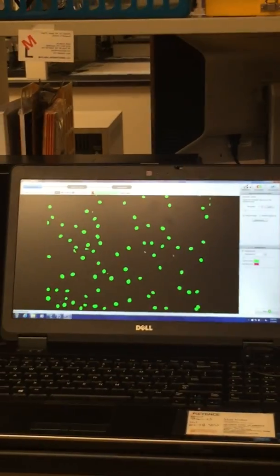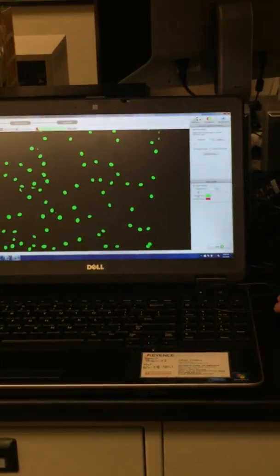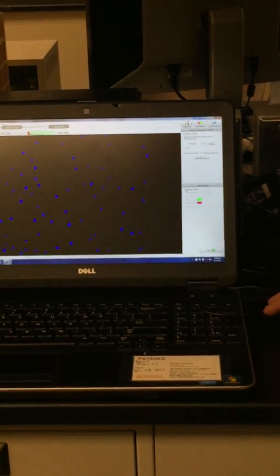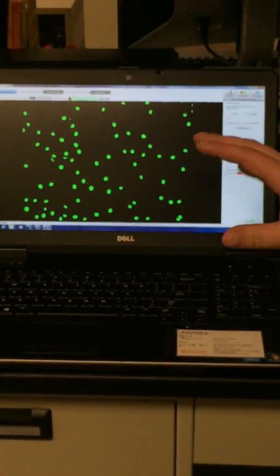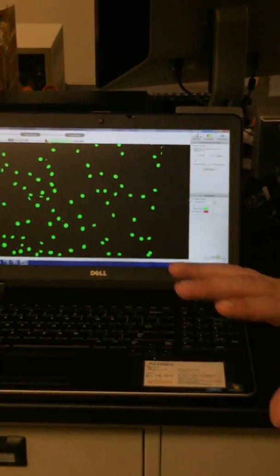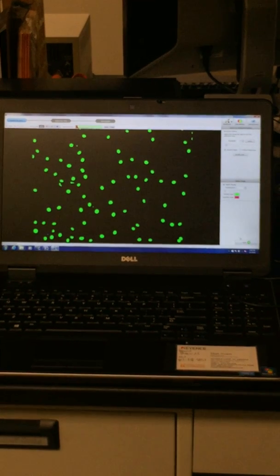So the system automatically highlights everything it thinks that you're interested in. You can always double check by toggling up and down this transparency right here. You can also just turn on and off the display really quickly. But once you have everything highlighted that you want, even if it's a little bit too much or not enough, I'd say just get it as close as it can be, and then go to next.